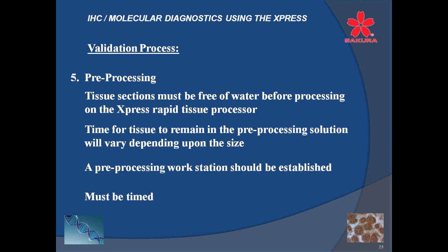A larger tissue, such as the spleen I was talking about, will take a little longer, but not that much longer. And then, again, it is a manual process, but set a timer, go do something else, and return. It doesn't take that long to move this from one solution to the other and then to the Xpress. It's a new mindset based on our continuous flow type of work system.